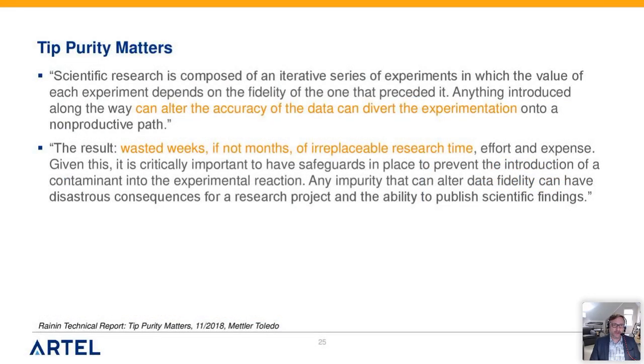I've included this quote here, just so we can at least talk about it. It's not just me that's saying this. This is pulled off of the Mettler Toledo website. They talk about pipette tip purity, but it really does affect the accuracy of the data. And what you don't want to do is waste time when you can do something about it right up front.